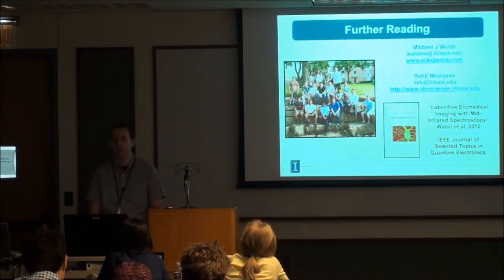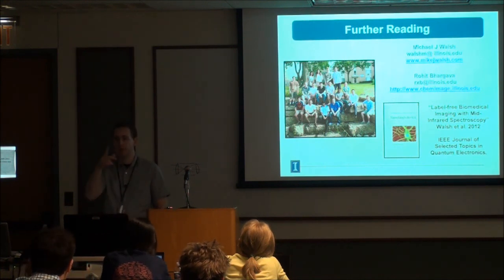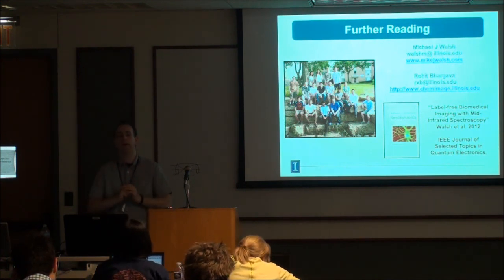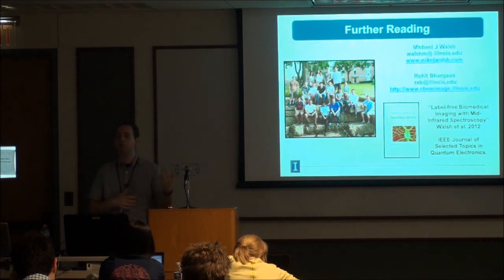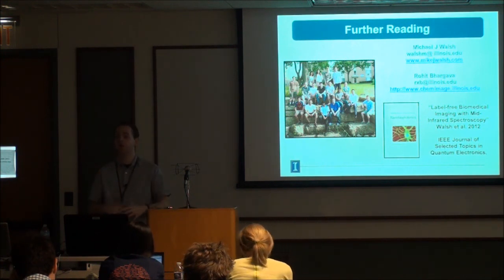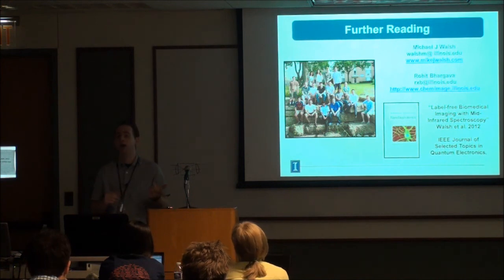We've got a few different approaches. We're developing a tool, actually, it's not been published yet, with David, who's a Beckman fellow, to interactively look at the spectrum and see in a more intelligent fashion what flags for different cell types. Up until now it's been very laborious going and looking for potential metrics, but there are more intelligent ways to do that. One thing you can also do is principal component analysis, derive a loadings plot. That'll tell you where the variance is, or even a linear discriminant analysis, and then use that to guide the metrics.